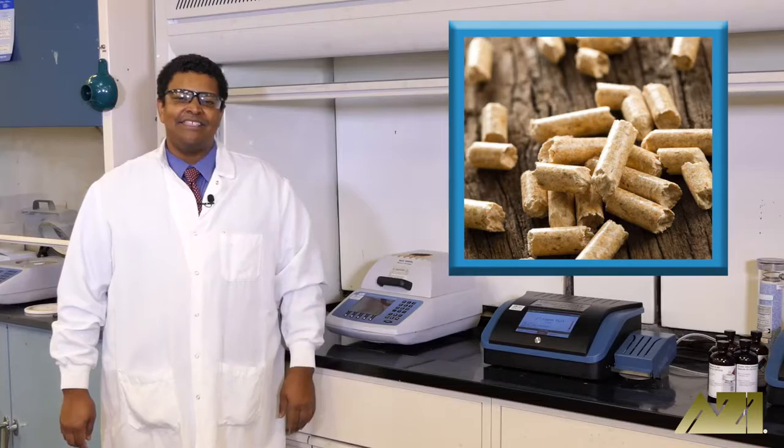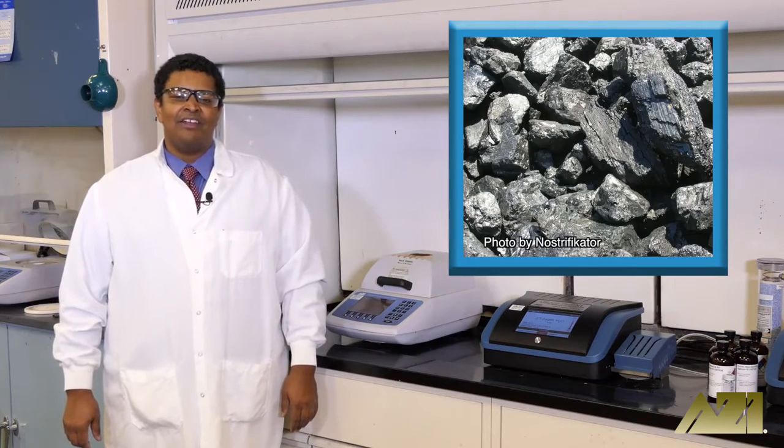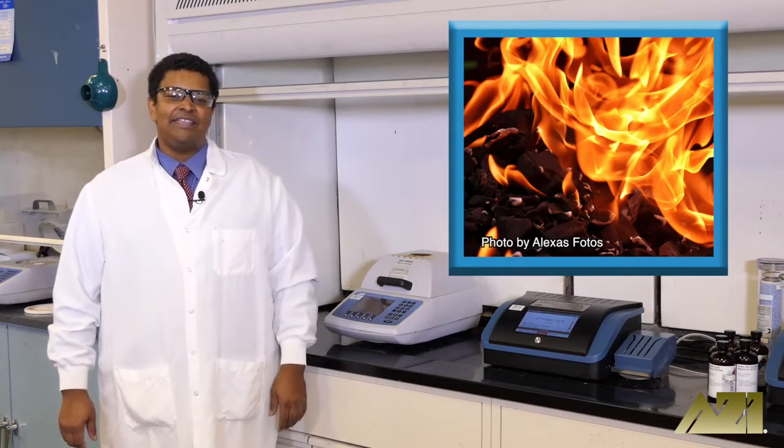Moisture content is an essential characteristic of wood pellets and charcoal alike. It helps determine vital characteristics of each product including burn time and heat intensity.